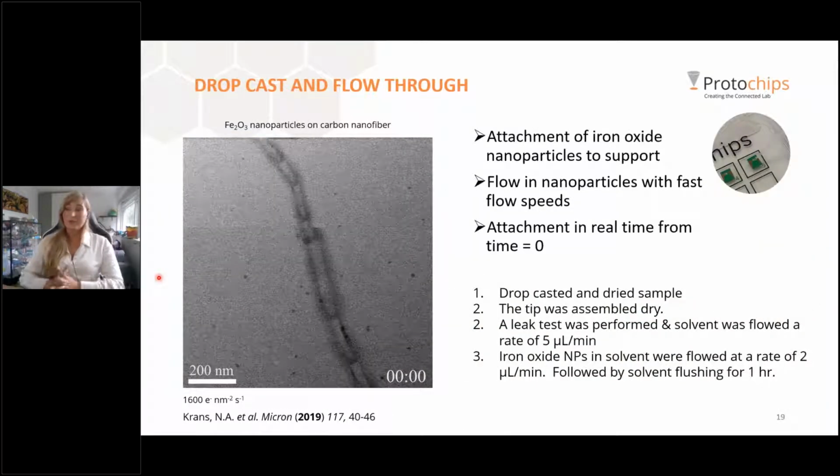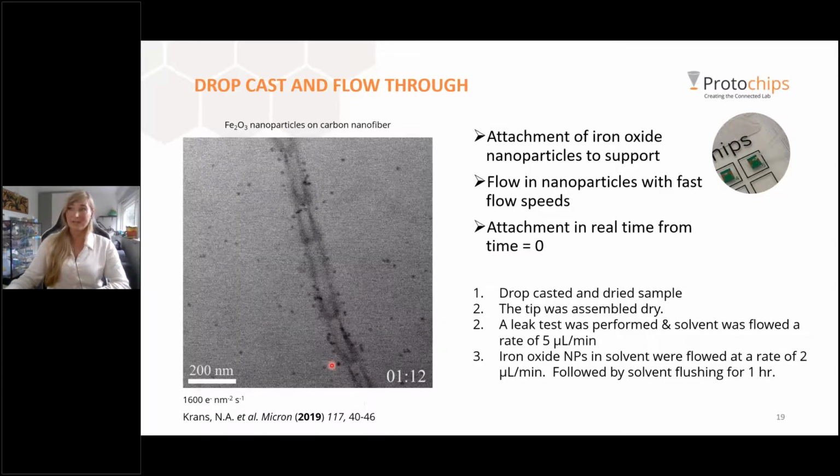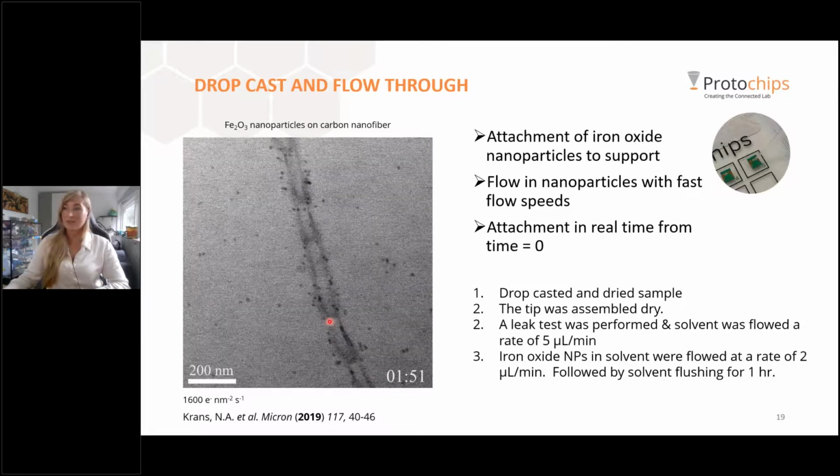I have an example here from literature. This is actually my own research, so it's always nice to show this. In this case, what we did is we added in advance some carbon nanofibers to our e-chip, and we drop casted and dried these on our e-chip. And then we flowed iron oxide nanoparticles through the cell to look at the assembly of the iron oxide nanoparticles on the fiber. And what you can see here is that because we drop casted that fiber first in place, we can really see the fiber from our bright field STEM images.